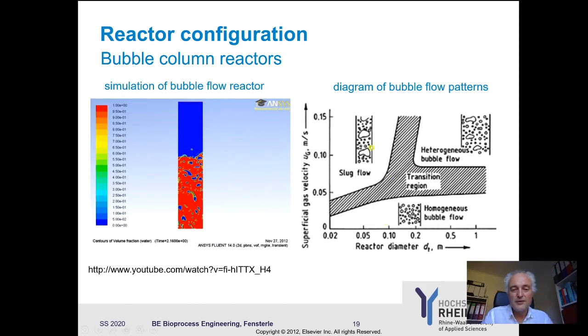You don't want a slug flow pattern where you have large bubbles just rising and exploding on the surface, and you don't want just a homogeneous bubble flow pattern.